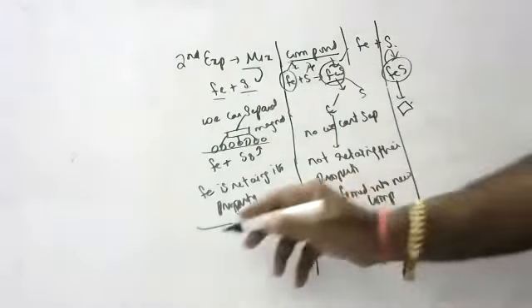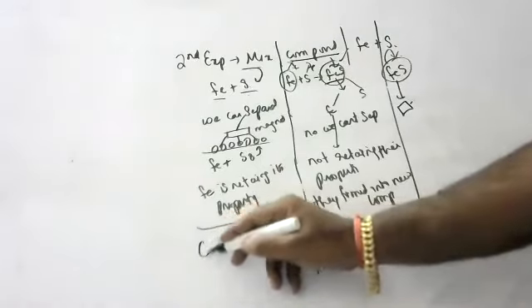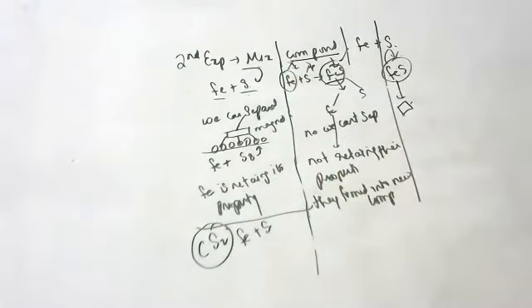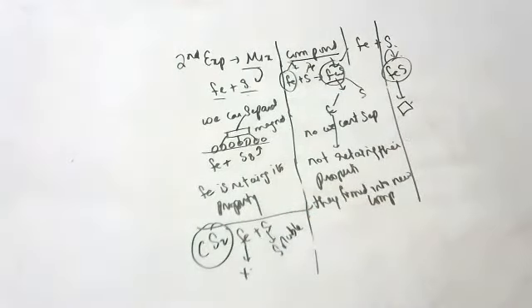Next, children, I will take carbon disulphide, which is a solvent, and mix iron and sulphur in it. What happens? In carbon disulphide, which is a liquid, sulphur is soluble, but iron is not soluble. Sulphur is soluble in carbon disulphide, but iron does not mix, children.